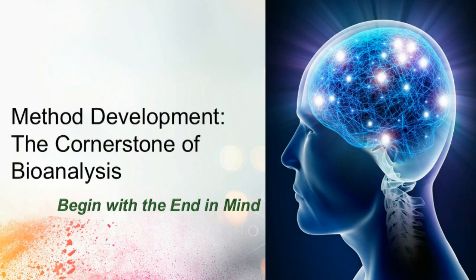The method is the cornerstone of bioanalysis. The statement "begin with the end in mind," for me, as a bioanalytical scientist, can be broken down to mean the bioanalytical sample collection, processing and storage, the bioanalysis itself, and finally the end use of the data.